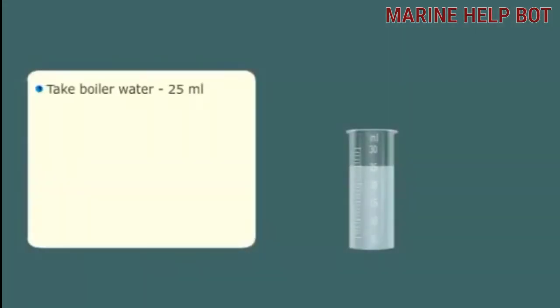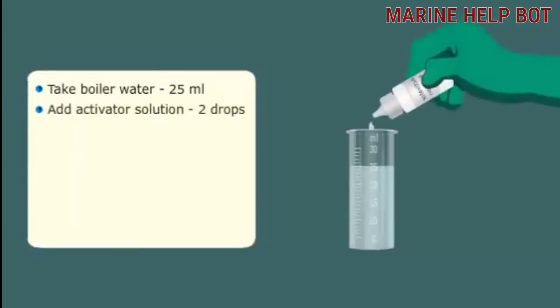Take 25 ml of sample water. Add 2 drops of activator solution. Stir to mix the contents.